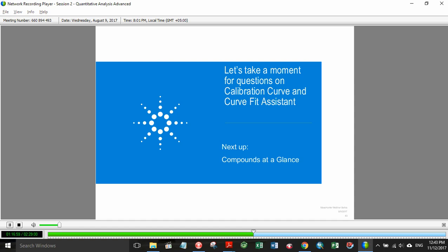Hey, Howard, let's take a few minutes here, pass it over to Howard again, and let's look at our Curve Fit Assistant stuff.